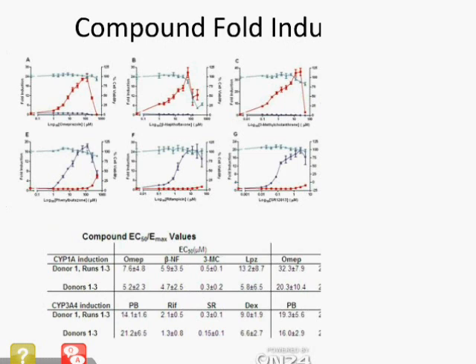And they also basically don't show any induction of the other enzyme in the triplex assay format, except at very high compound concentration levels. In addition, some compounds, again, as was previously explained by Tracy, show induction of the enzyme, and then the induction decreases at high compound concentration levels.